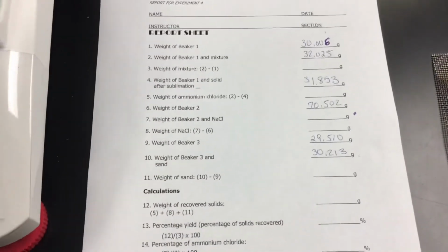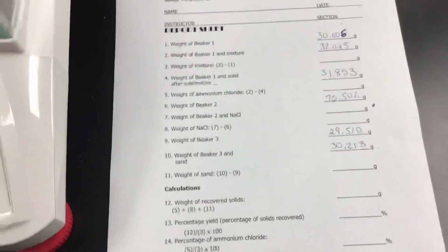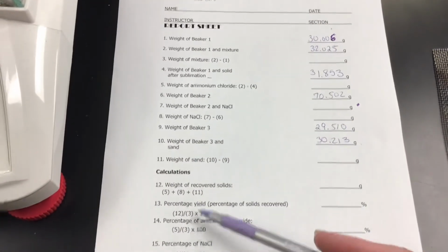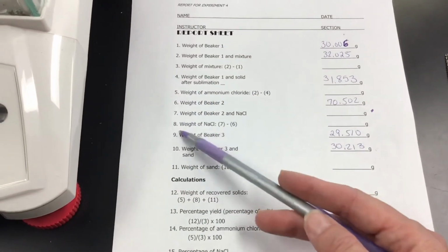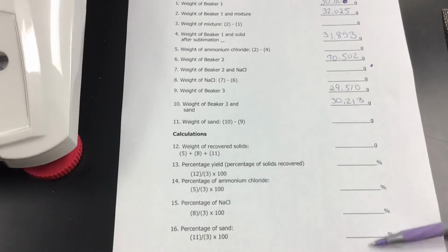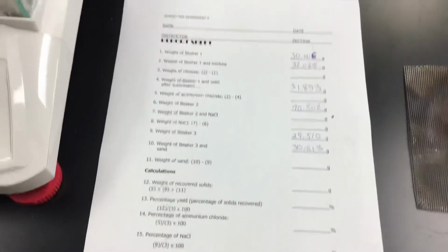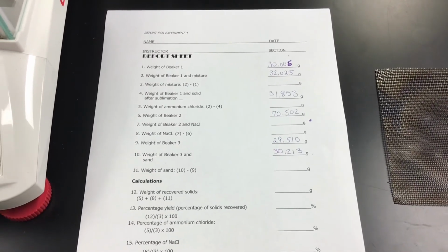Okay, so really what we're waiting on is that last bit of water to evaporate. You can go ahead and do some of these calculations. And again, they have all the numbers set up for you, like add 5, 8, and 11 together. So you would just go 5, 8, and 11, and you just follow the steps, and it'll tell you. Hopefully, you guys will get close to 100%, and I haven't done the experiment completely wrong today. All right, so I will come back when that beaker is almost done.